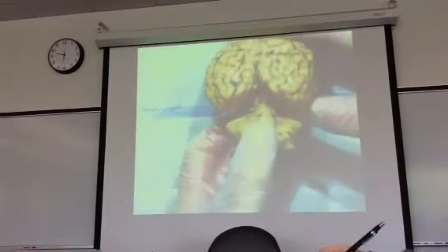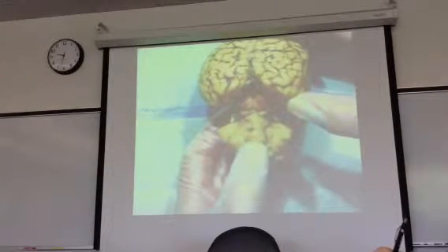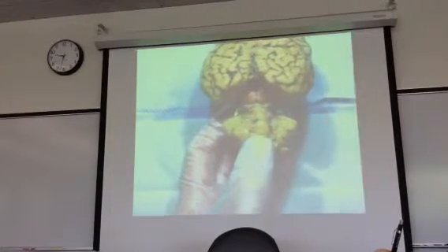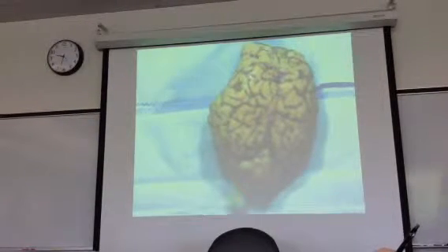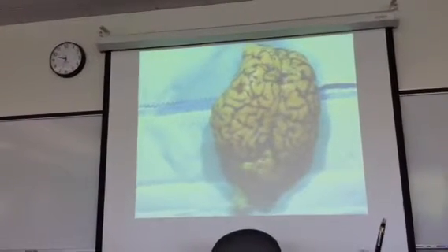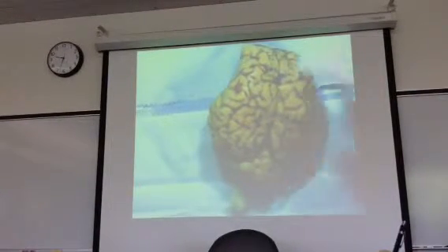Okay, now very, very carefully, if you gently pull down the cerebellum, pulling it away from the cerebrum, can you see something that sort of looks like a baby's butt sitting on a toilet seat? Did you guys see that? Okay. This entire structure, cheek on the left, cheek on the right, left half of the seat, right half of the seat, it has one name. It's called the corpora quadrigemina. Loosely translates into body made of four parts. Corpora quadrigemina. It's composed of the butt cheeks and the toilet seat.